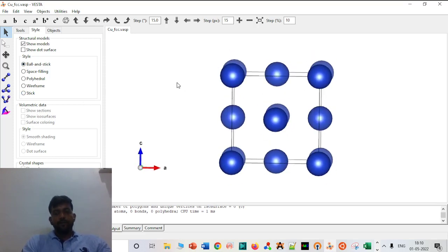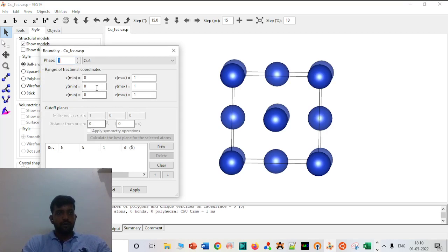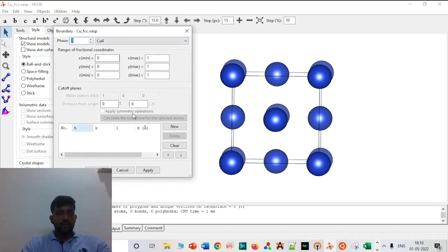I think now what I should do is I should extend it. So there is an option called boundary, and I don't think you will see this because my video picture is coming in that option.